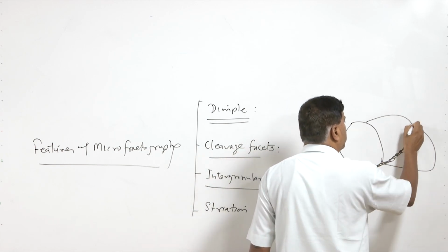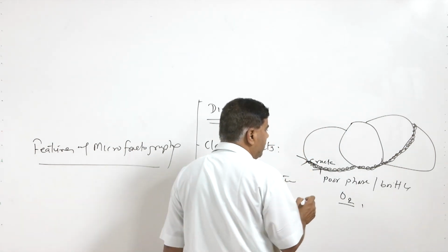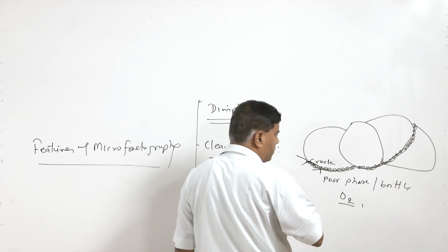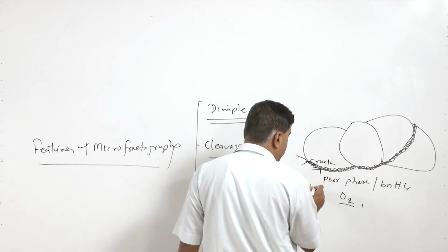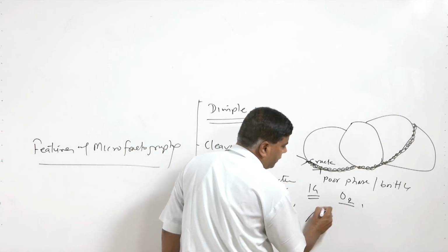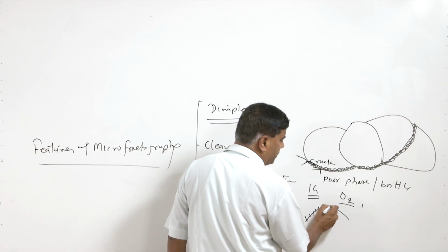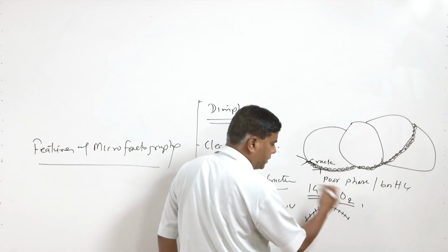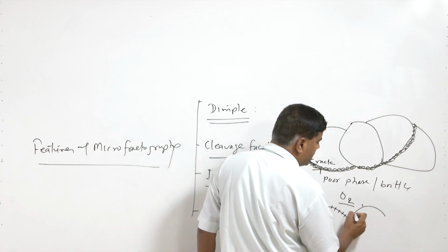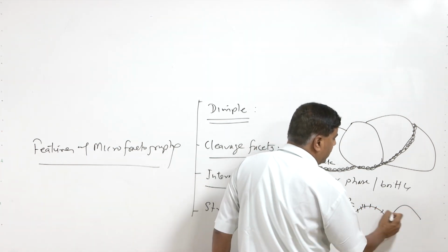The propagation of the crack along the grain boundary will lead to intergranular fracture, and whenever it happens, we will find that the fracture has a separated appearance: the separation of the grains has taken place through the grain boundaries, and the grain boundaries will be exposed on the surface in this form.